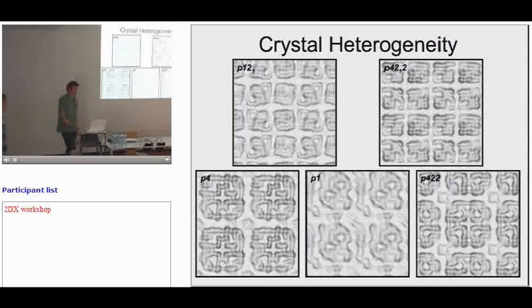Did you take those diffraction patterns at helium temperature? No, these were all at liquid nitrogen temperature. And our Polara is set up for using both, and in my hands there's no noticeable difference. I think the quality difference from crystal to crystal is greater than the quality difference from helium to nitrogen, so I could never tell a difference.